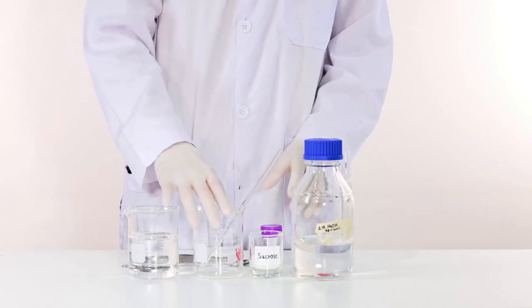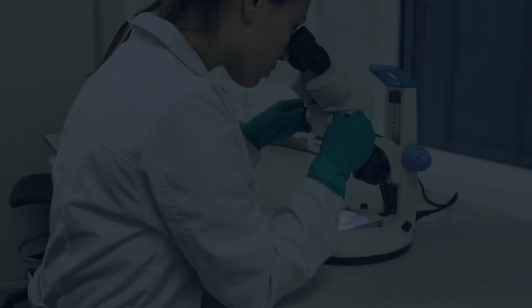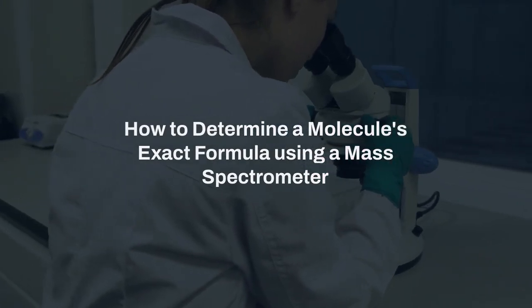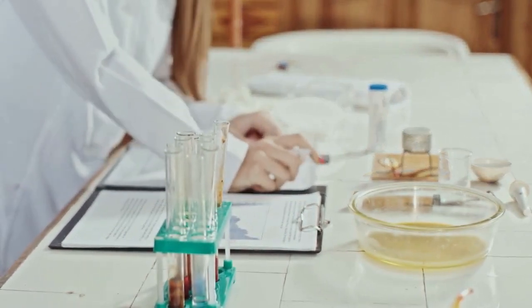Hello everyone and welcome. Today, we're going to tackle a really useful technique in chemistry. We will learn how to determine a molecule's exact formula using data from a mass spectrometer. It might seem intimidating, but we'll break it down into simple, manageable steps.